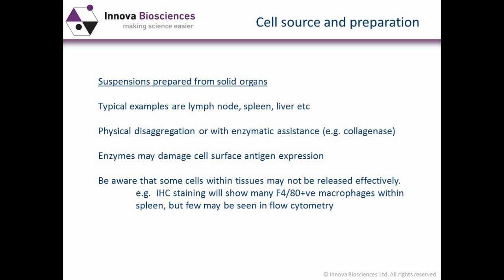One thing to be aware of is that not all cells are released from tissues in the same way. So if you take a spleen sample and disaggregate that manually, you will find that lymphocytes are released very easily, but that macrophages tend to be, shall we say, stuck within the tissues.